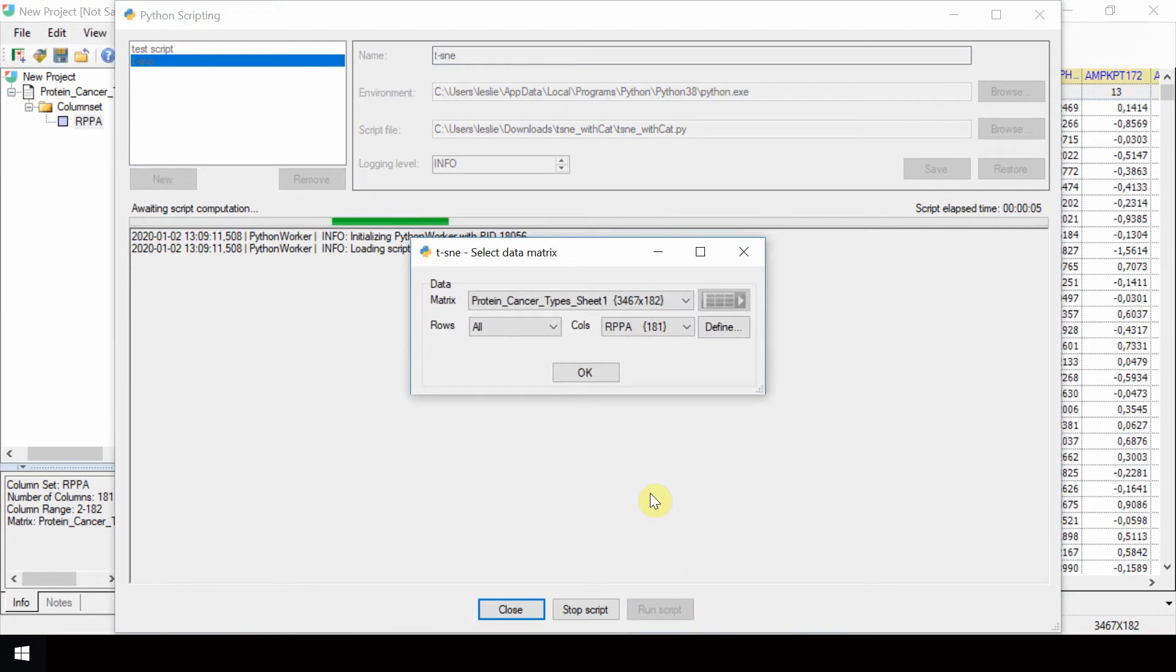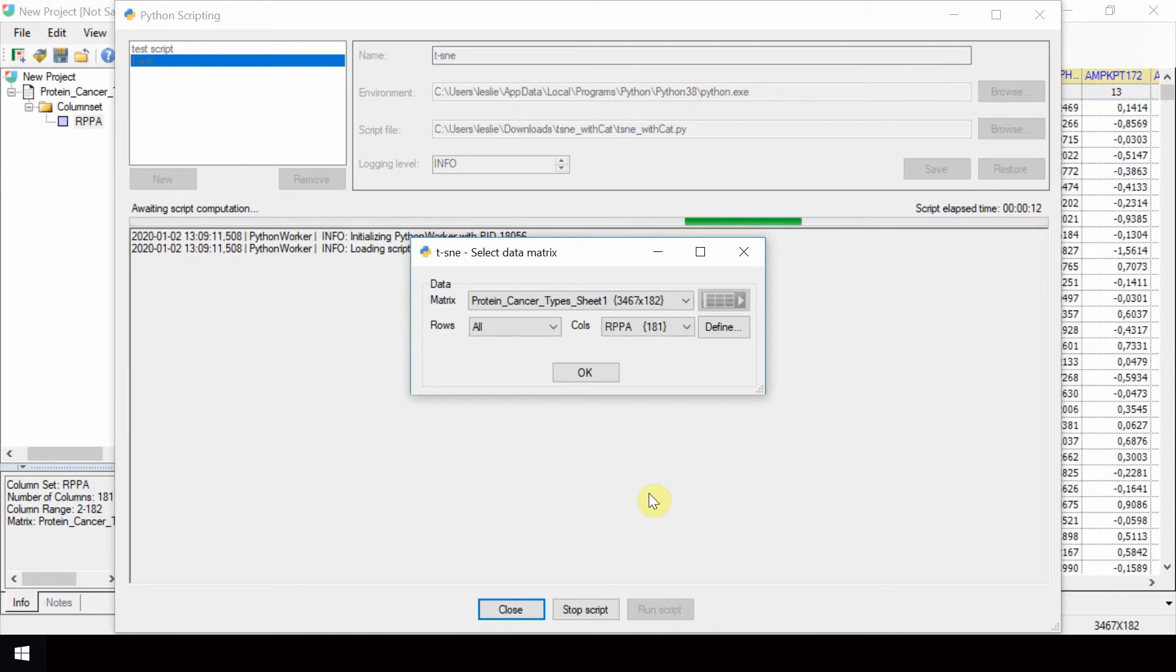A first dialog box will appear to define the X data matrix to perform the TISNY on. This works in the same way as when defining inputs for analysis in Unscrambler.